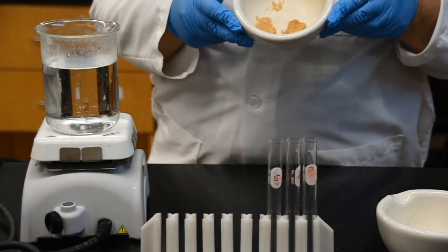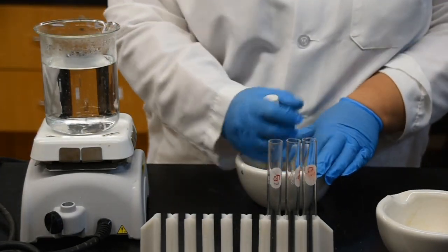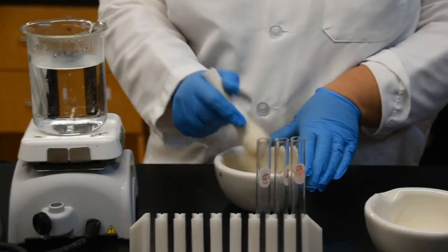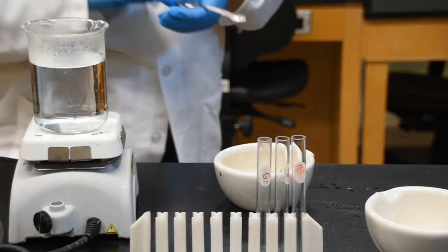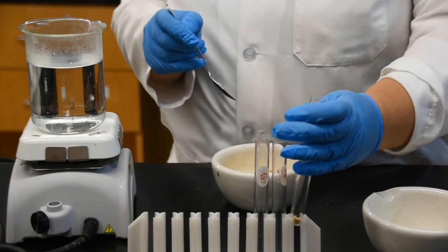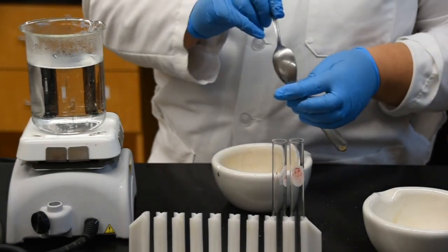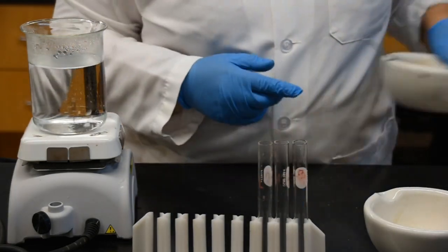I'm going to start with my granola bar. So I'm going to grind this. And the smaller your food sample is, the better it would be for you to run your experiment. So this was easy. So I'm going to use my spoon to add a little bit of food sample to each of my test tubes. And again, each food sample will be tested for simple sugar, will be tested for starch, and will be tested for proteins. So here are my 3 food samples.